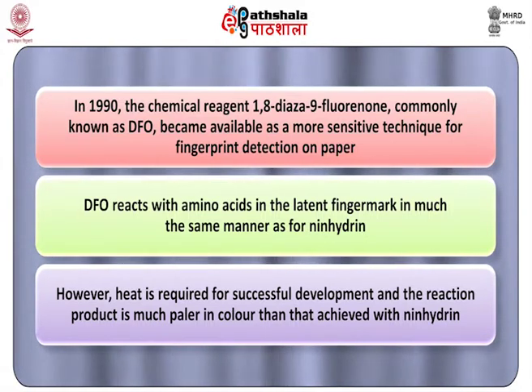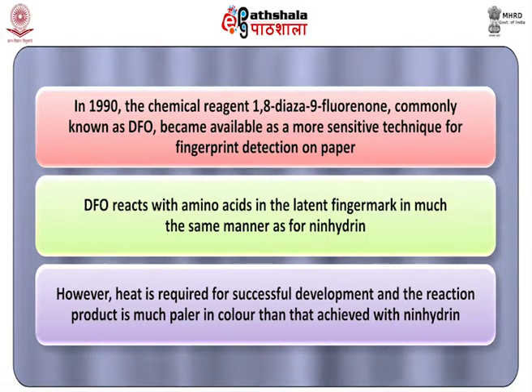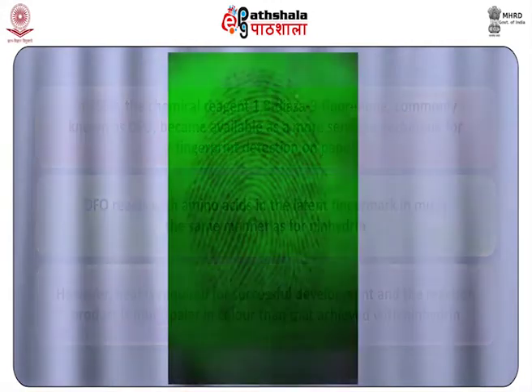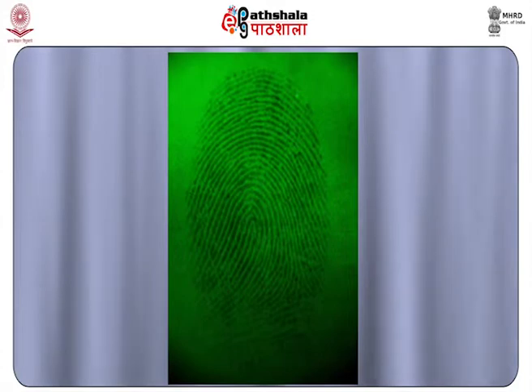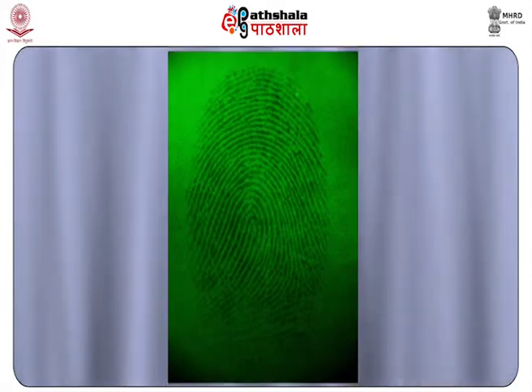However, heat is required for successful development, and the reaction product is much paler in color than that achieved with ninhydrin. The advantage of DFO is that developed prints are highly luminescent at room temperature without any additional treatment.